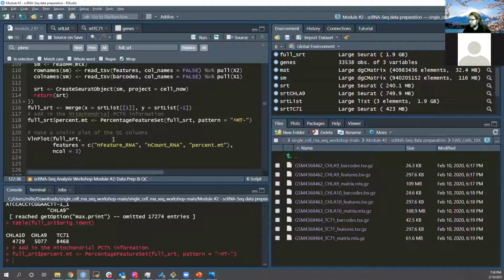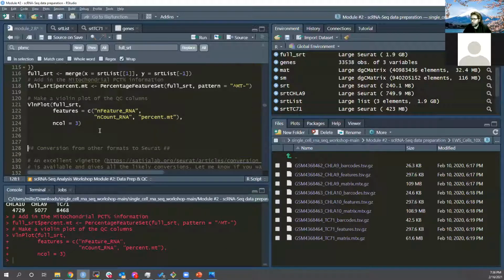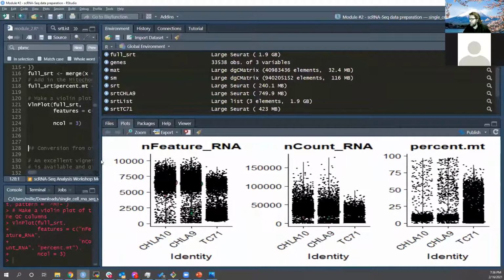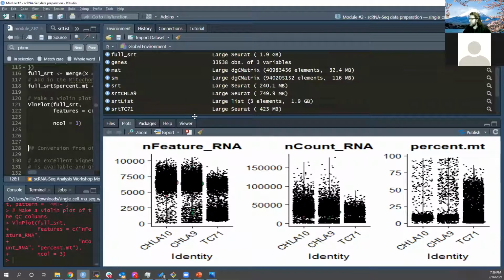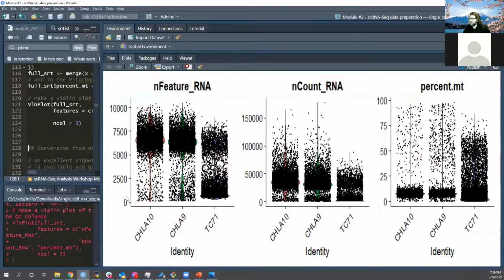This might look a little bit messy at first, but just bear with me. So this is the violin plot with everything, and we're not going to differentiate at all based on the cell line. Okay, so ton of data, way too much to easily interpret. Oh, actually, no, we did differentiate it. I guess by default now it does stratify them. Okay, great. Actually, that does make sense because the identity was their cell line. So this is perfect. Okay, it's going to take a second to adjust, but all right.